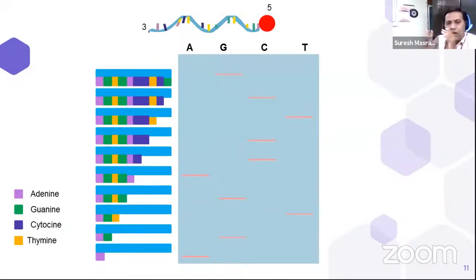Now, after that, we go for the electrophoresis. Again remember, the single stranded DNA fragment which we put into all the reaction mixtures is radioactively labeled by 32 phosphate towards its 5 prime. That is one thing. Now, we pour the content of these 4 reaction mixtures into the gel.